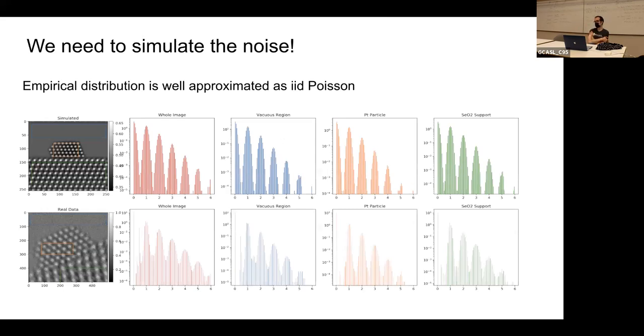In the course, we often say the noise is additive and Gaussian. But often in life, things are not additive and Gaussian, and in this particular case, it's not. It's Poisson. Do you want to explain this a little bit, Shreyas? We have reasons to believe that it's Poisson. The detector physics tells you that it's Poisson. And it's the same thing that happens in your camera. When you take pictures in low light conditions, the noise is predominantly Poisson. So we have a starting point, and the physics tells us that it's Poisson.